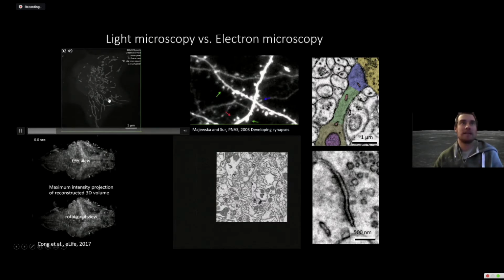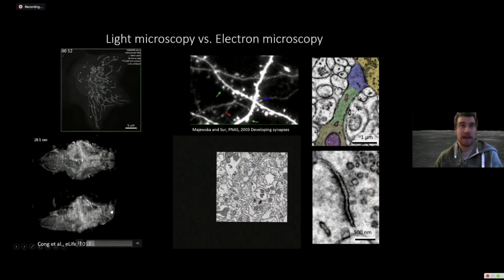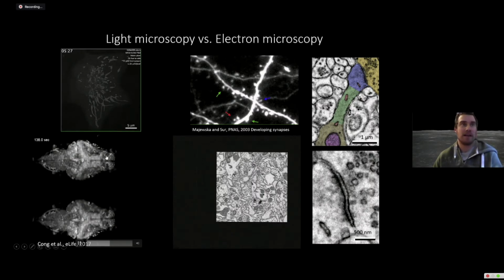Here in a cultured cell, you can see mitochondria, and this is from Kara Shivan that works with core and Dr. Manner. You can see the behavior of mitochondria inside a single cell. Here in a behaving zebrafish, you can watch individual neurons firing as it's embedded in agar, so it's not moving much.